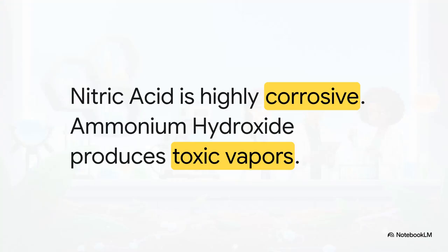Actually, before we even think about touching a sample, Dr. Chem is super clear on this. Safety is paramount. We are dealing with some seriously intense reagents here. Nitric acid, it's highly corrosive to both your skin and your equipment. And aqueous ammonium hydroxide produces these toxic, really nasty vapors that can severely irritate your respiratory tract.